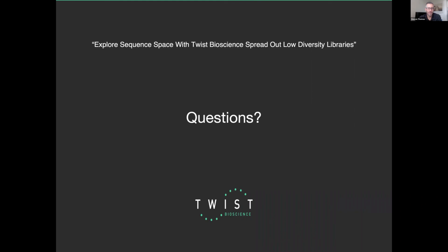This is what I love, this question. So this is someone coming to us with their dream library. So I'm interested in building a mutation library on cDNA that is 5 KB in length. What is the best strategy to do that? Ooh, okay. I think first we need to look at where the diversity is located.